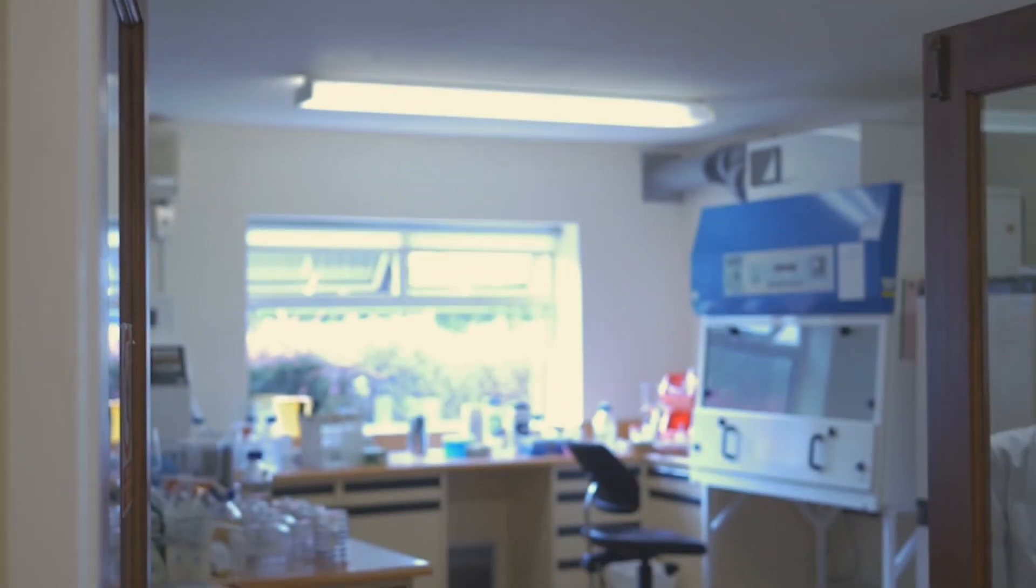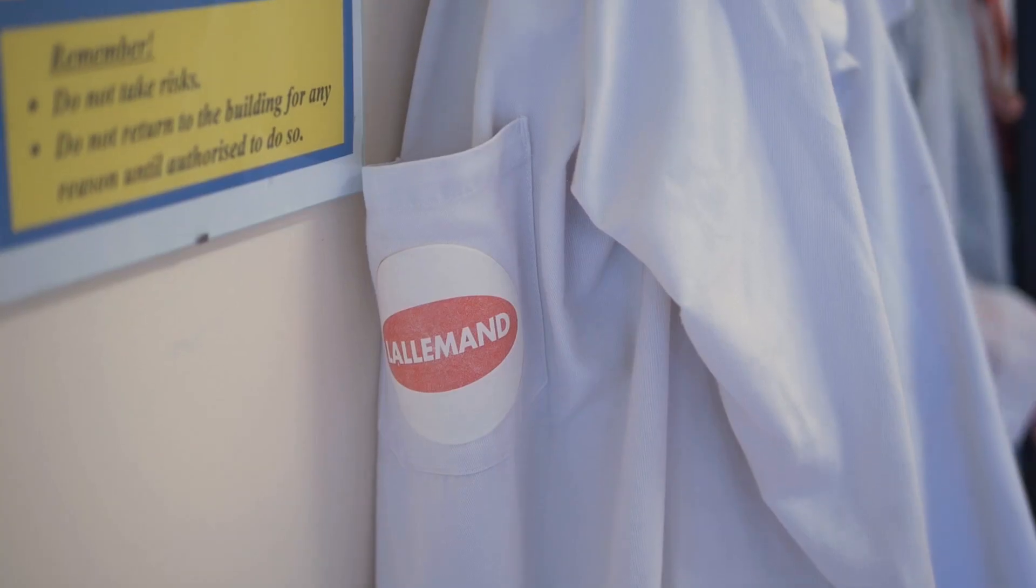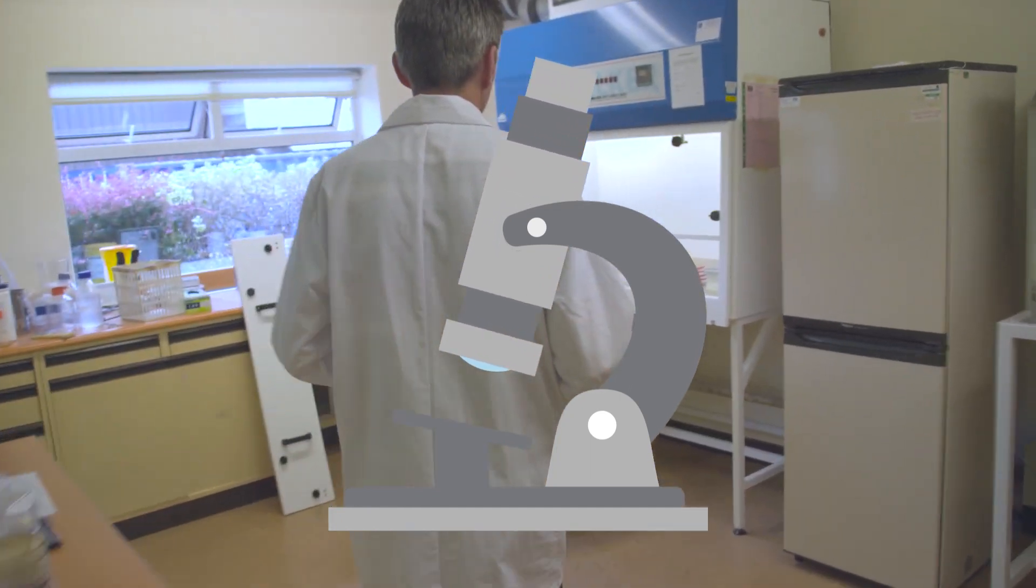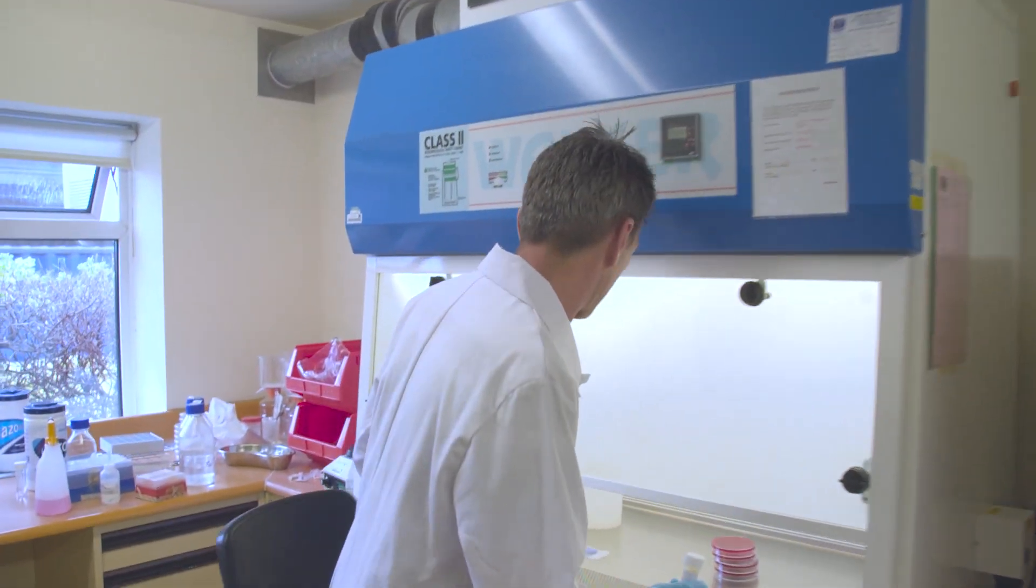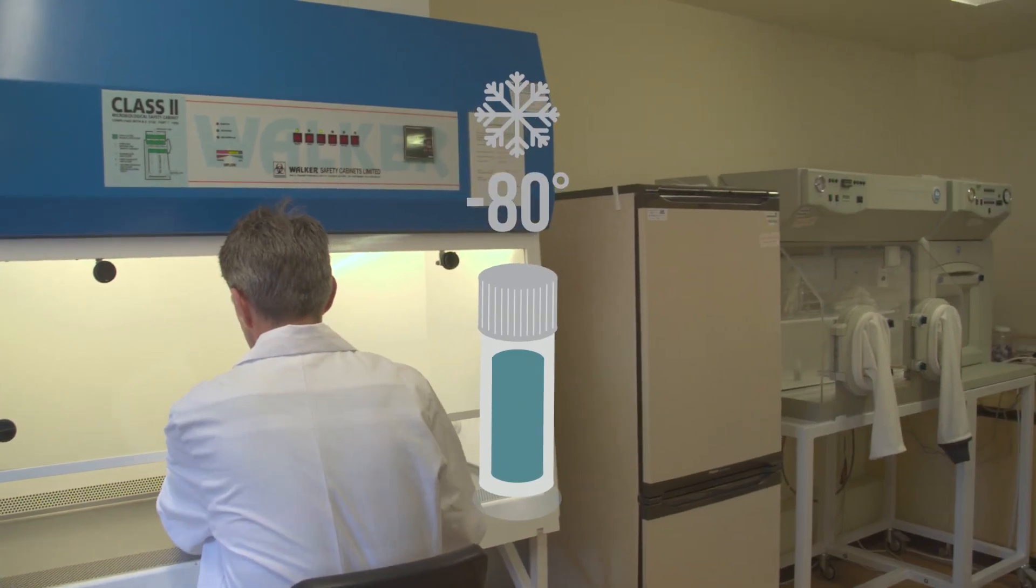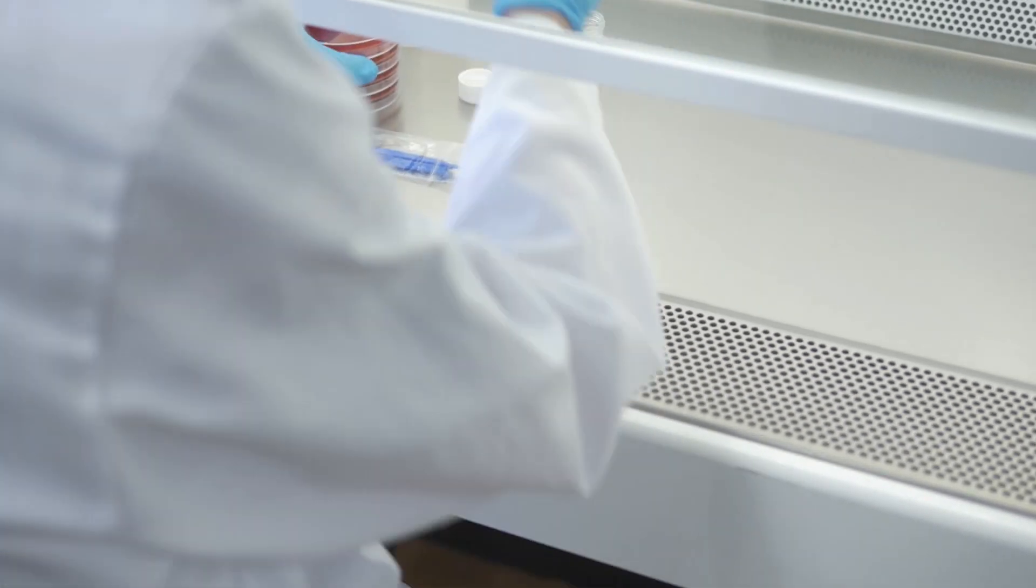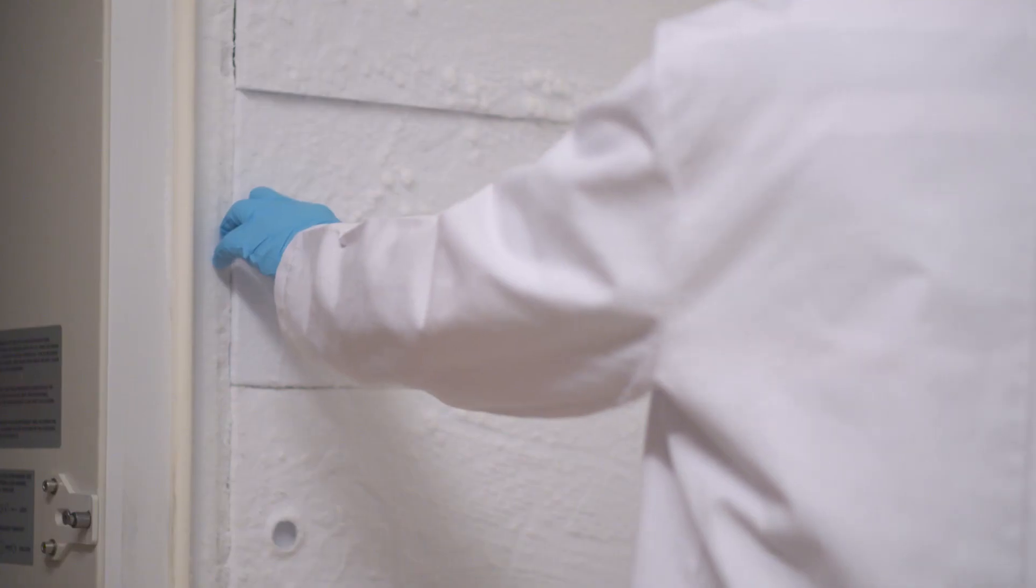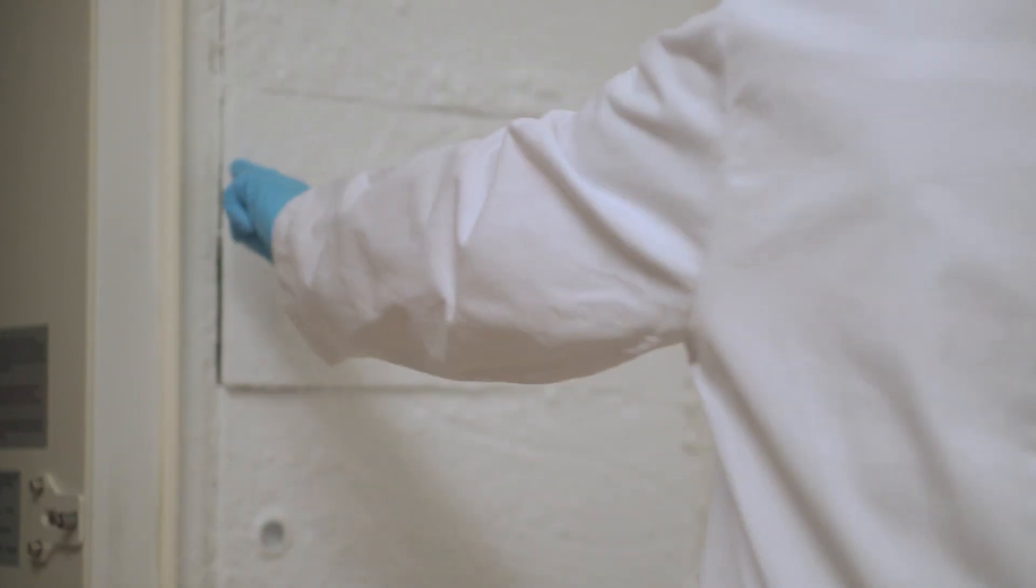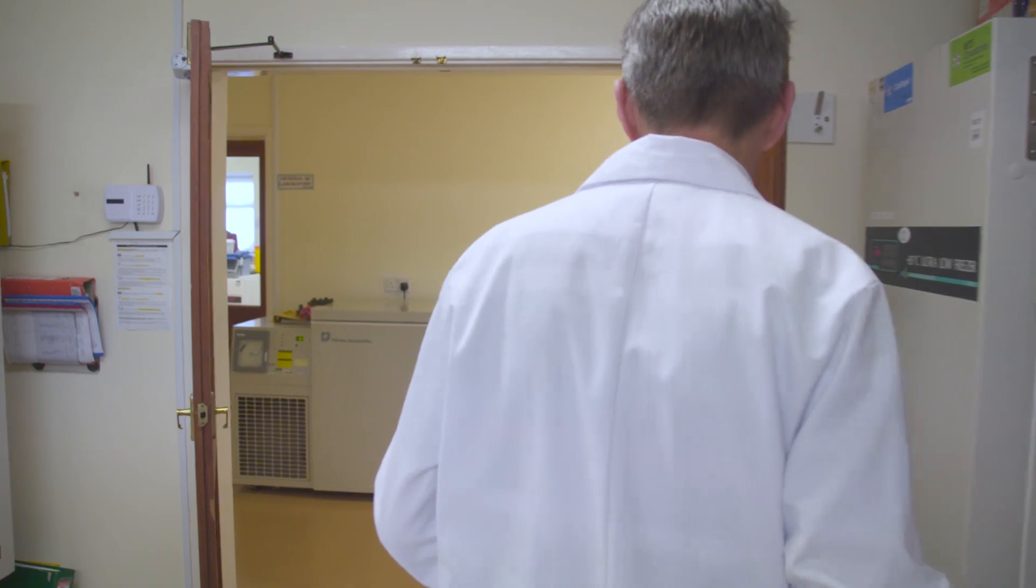The process starts in the laboratory area where bacterial culture required for production is tested for purity on agar plates. We take the culture required, which is stored in a small vial from a minus 80 degree centigrade freezer. All our bacteria are stored here. This ensures our bacterial strains are in good condition and ready for the production process. They're tested on a regular basis for strain purity.